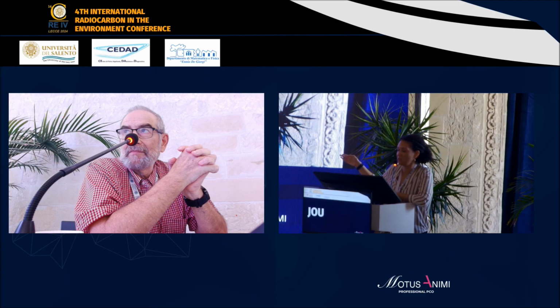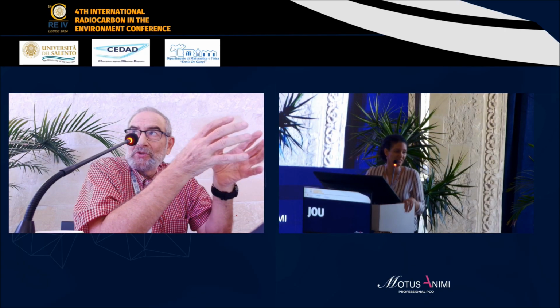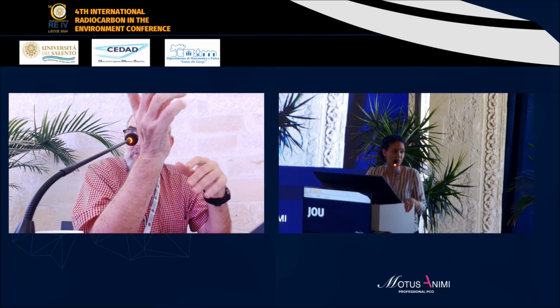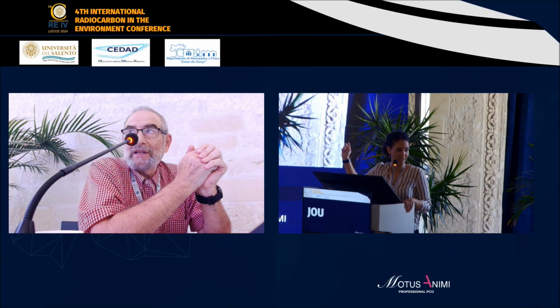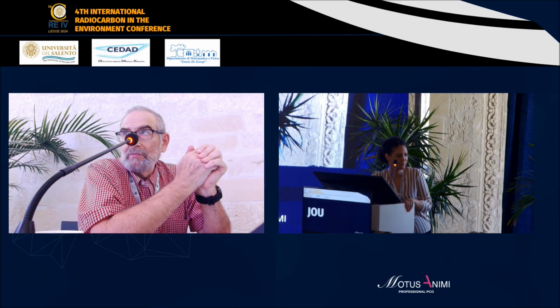In biogenic source and fossil source, the contamination is... Do you think this ethanol was growing in a field, or it was a mixed synthetic ethanol from petroleum and natural? No, it's biogenic source, only sugar cane, in this case. Yeah, that actually looks like a mix of synthetic ethanol made from petroleum.